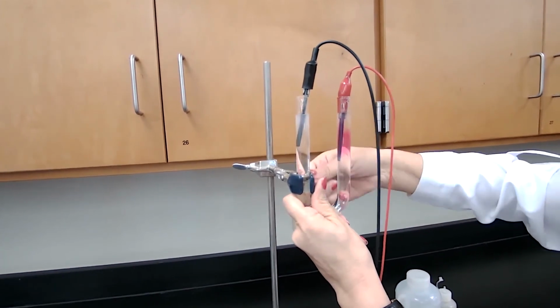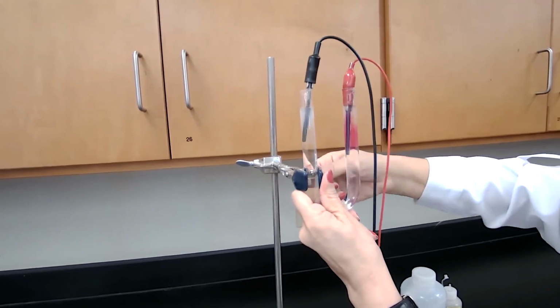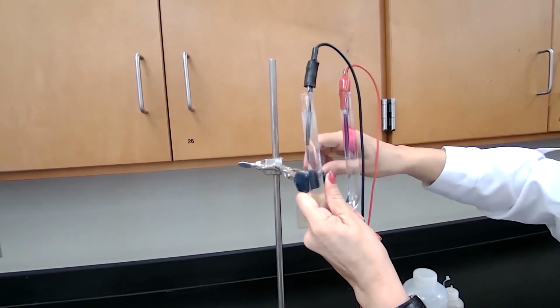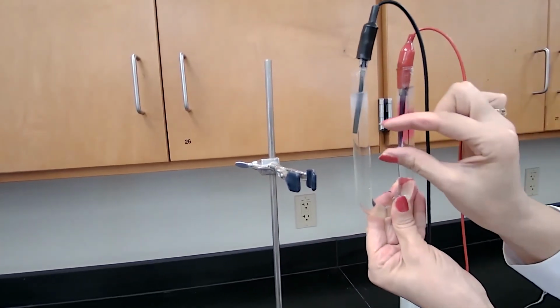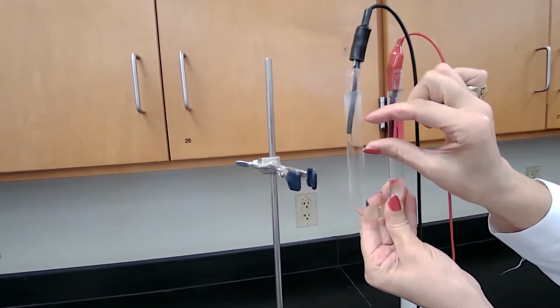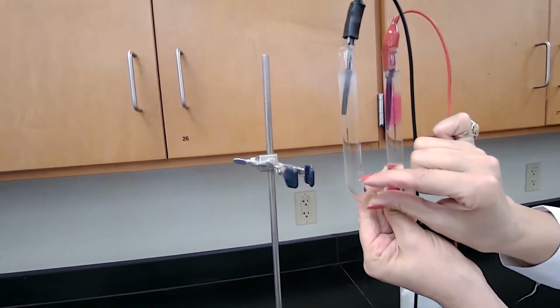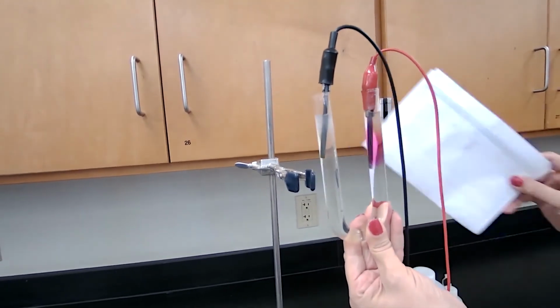It's very obvious to me right now. A very light yellow-green color has been produced. But for you, I want you to compare this. When I put the white background, I want you to compare this area of color to this side, which is the clear liquid with no color.